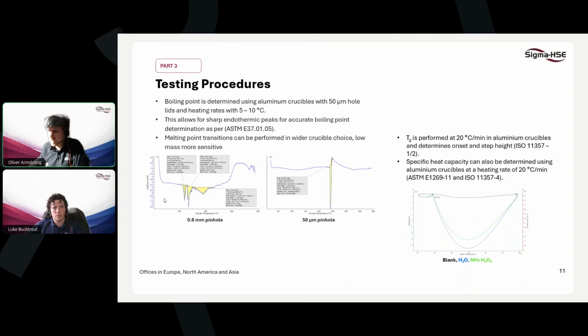Oh yeah, so just quickly, it's a much sharper and cleaner peak on the smaller 50 micron pinhole size, which is what we're trying to achieve. But we can see a relatively smooth baseline response up to the sharp endothermic boiling point, following which we can see an increase in the heat flow, which would point to a potential event happening here.